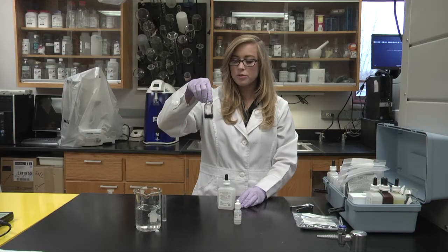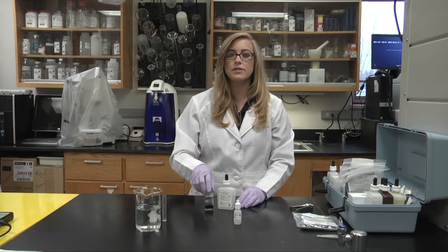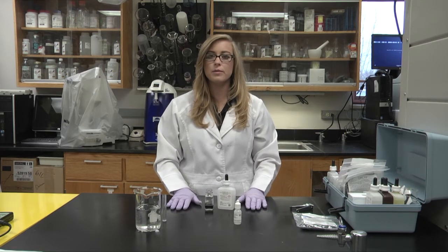That was 7 drops, so we'll multiply 7 by 17.1 to get our answer in milligrams per liter.